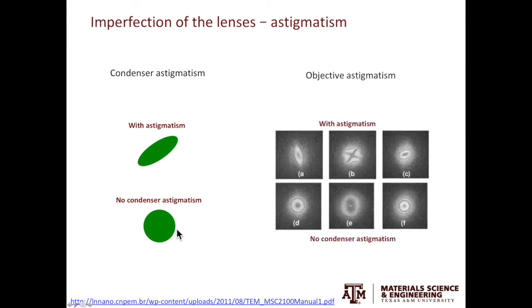The second type of astigmatism that you can correct is called the objective astigmatism. In most cases, if you are taking images at relatively low magnification, you don't have to worry about the objective astigmatism. Objective astigmatism becomes important when you are taking images at higher magnifications, especially when you try to take the hi-res images to show the lattice fringes.